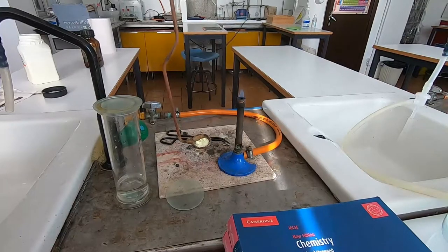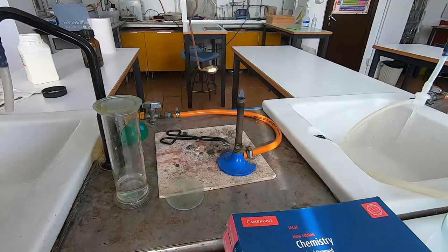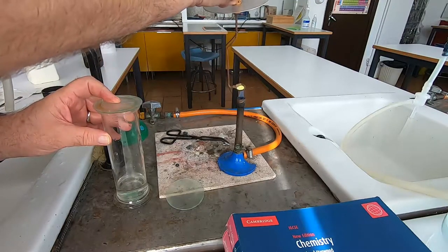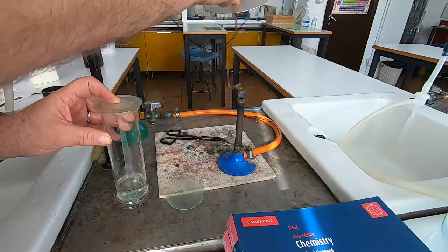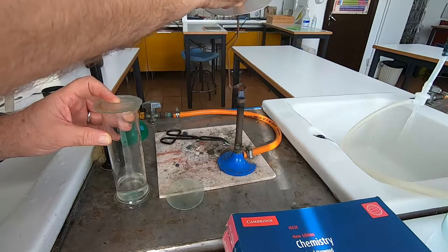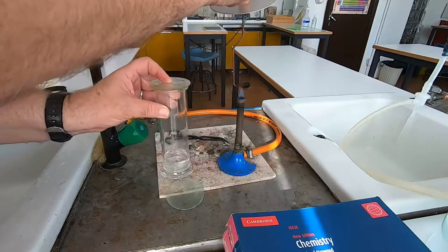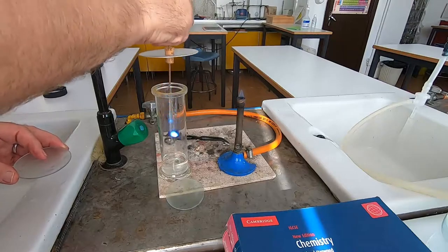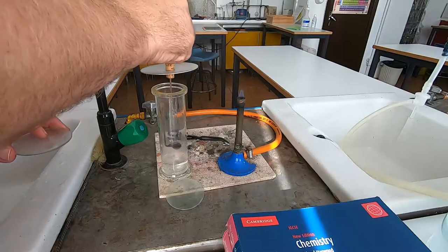The next element we're going to look at is sulfur — this is a non-metal. We're going to burn some sulfur and then put it into the oxygen. Here it is in a deflagrating spoon. Sulfur melts at just over 100°C — you can see it has melted, it changes colour, and then usually catches fire. It's actually boiling now and burning. When we put it into oxygen, you can see it burns with a blue flame.